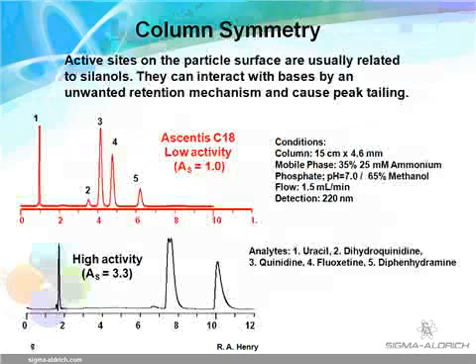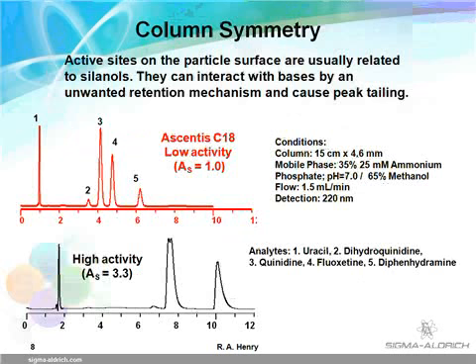Peak symmetry also affects column efficiency and therefore resolution. Strongly adsorptive or active sites are often responsible for tailing peaks. Columns may show high efficiency and resolution for neutral solutes and very poor efficiency and resolution for bases or acids. Solute tailing is often accompanied by additional retention, as shown in the two separations on similar stationary phases.